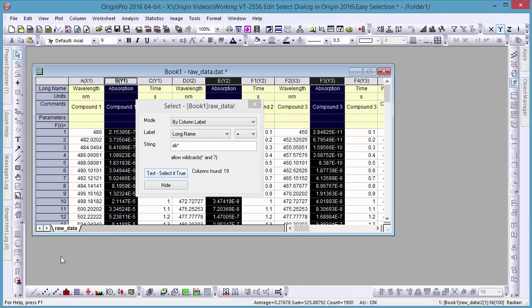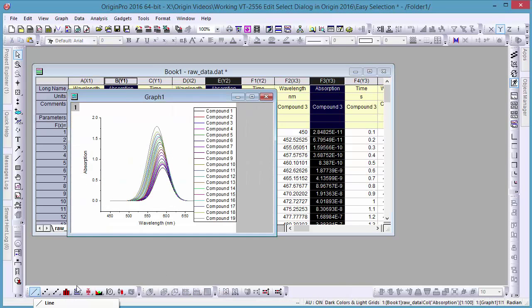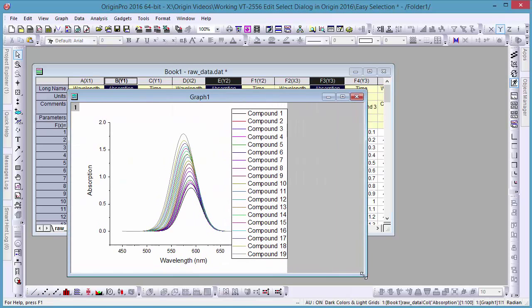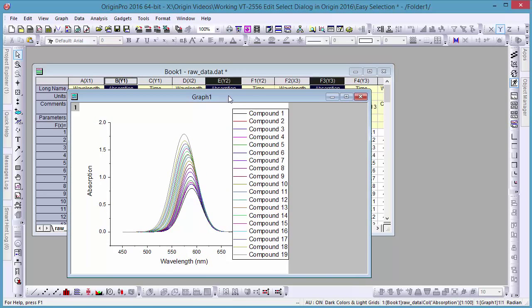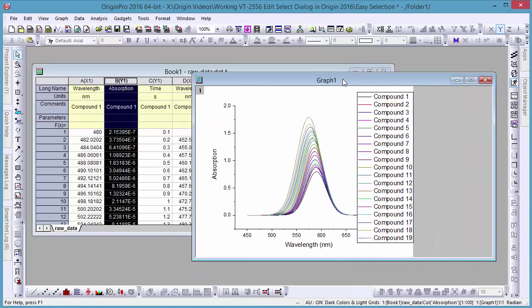Once our columns are selected, we can select the Line Graph button on the toolbar and readily generate a plot of all of our absorption values.